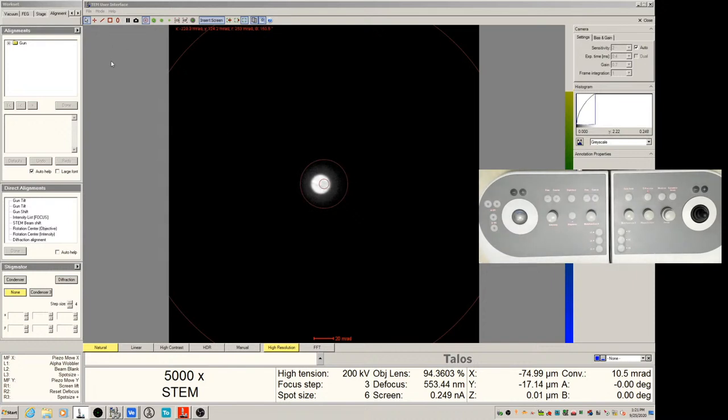All right, so in the SOP, I have listed two methods to find the eucentric focus. Method one is, if you are familiar with our 2100 and 3100, similar to how we find eucentric height on those two TEMs. You are just watching this beam, which I'm going to call the Ronchigram. If you look carefully inside this small beam, right now you can see the image. Now you see the square bar over here.